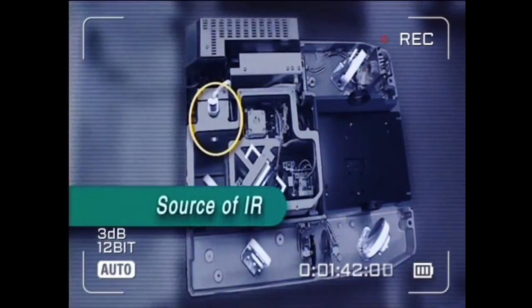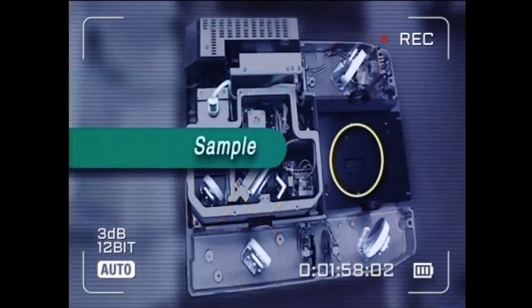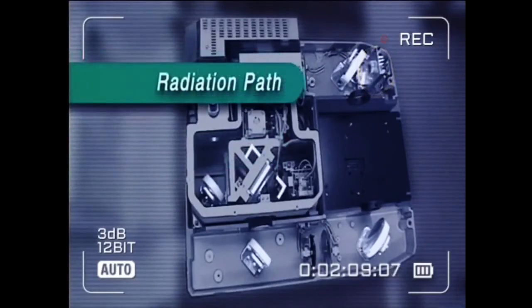All IR instruments have a source of IR radiation. This is a coil of wire surrounded by a ceramic capsule which is heated electrically so it gives off IR radiation. The IR radiation is directed by a series of mirrors into the sample, which is placed here. The radiation not absorbed by the sample arrives at the detector situated here.